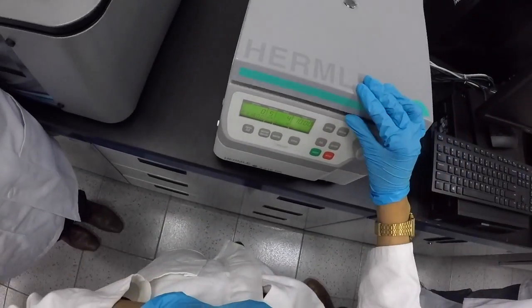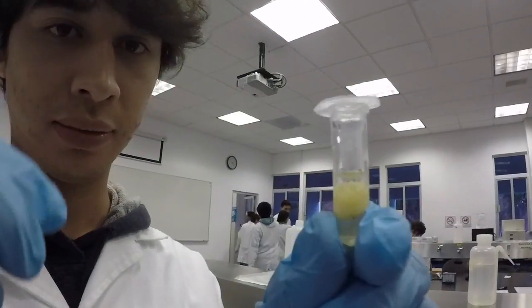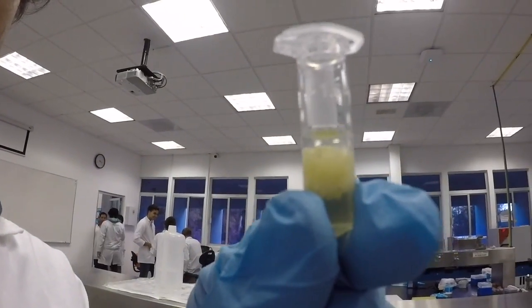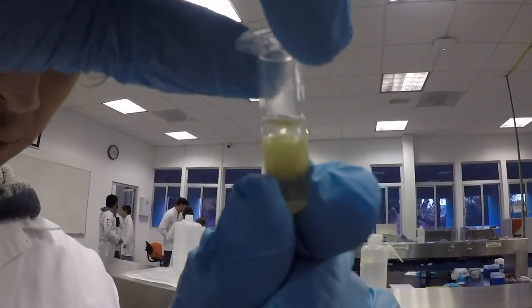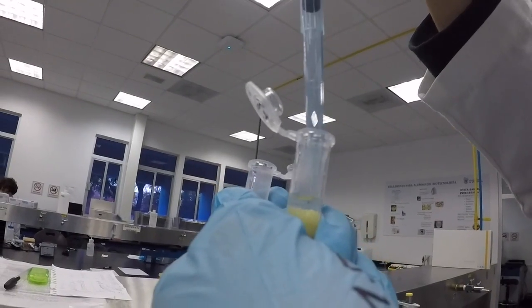Past the 10 minutes, the centrifugation produced 3 layers on the microtube that were very easy to see. On the top, the liquid or aqueous phase, in the middle, the debris or proteins, and on the bottom, the chloroform.